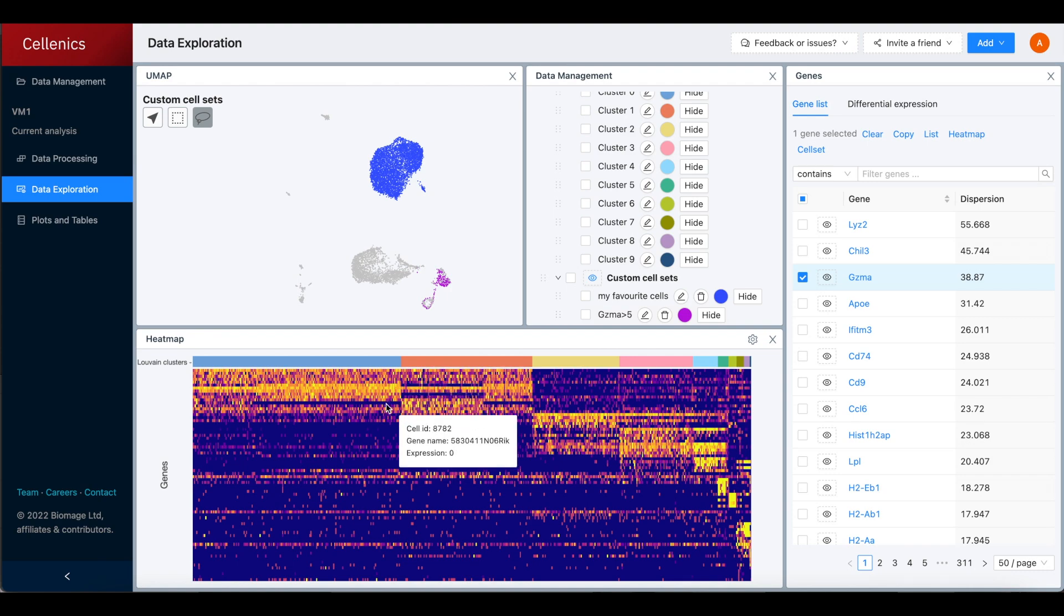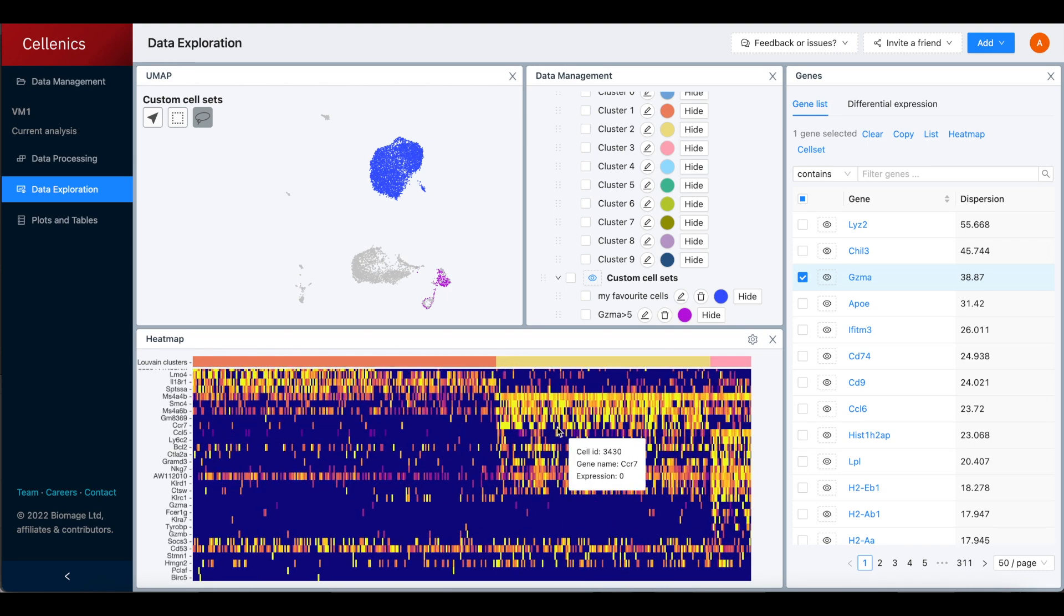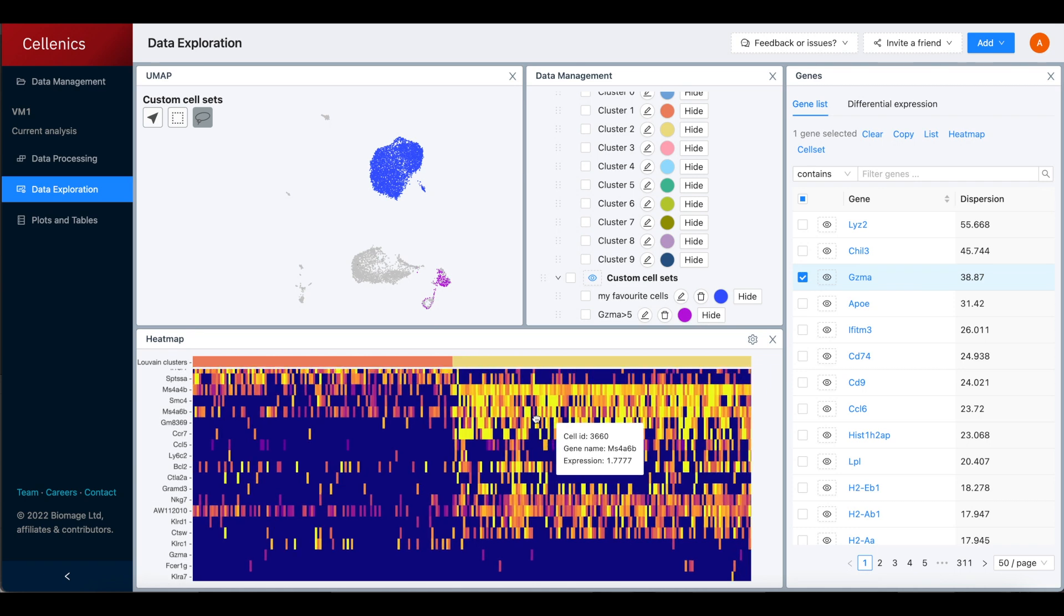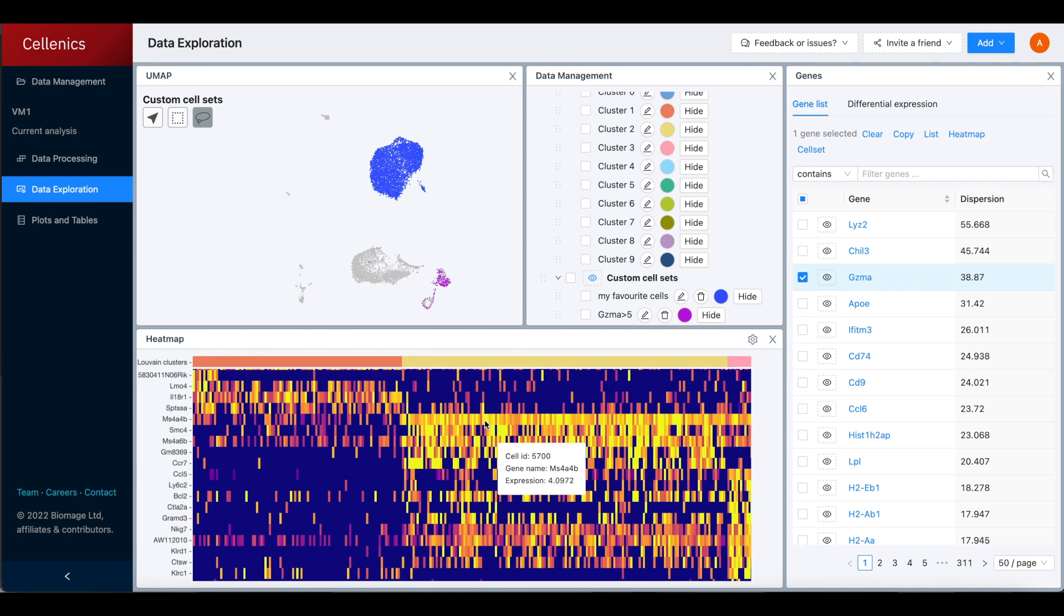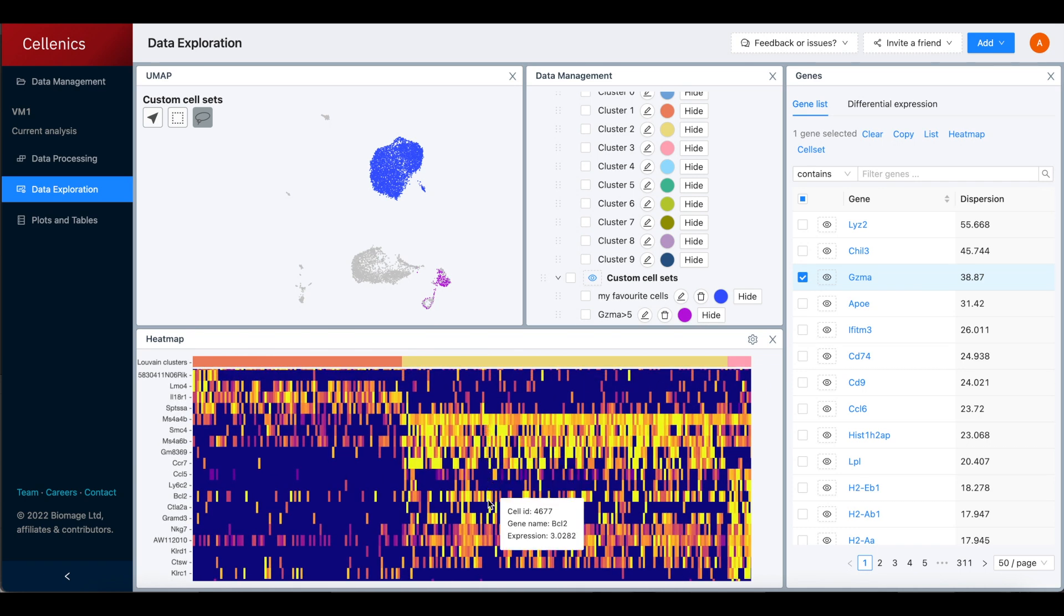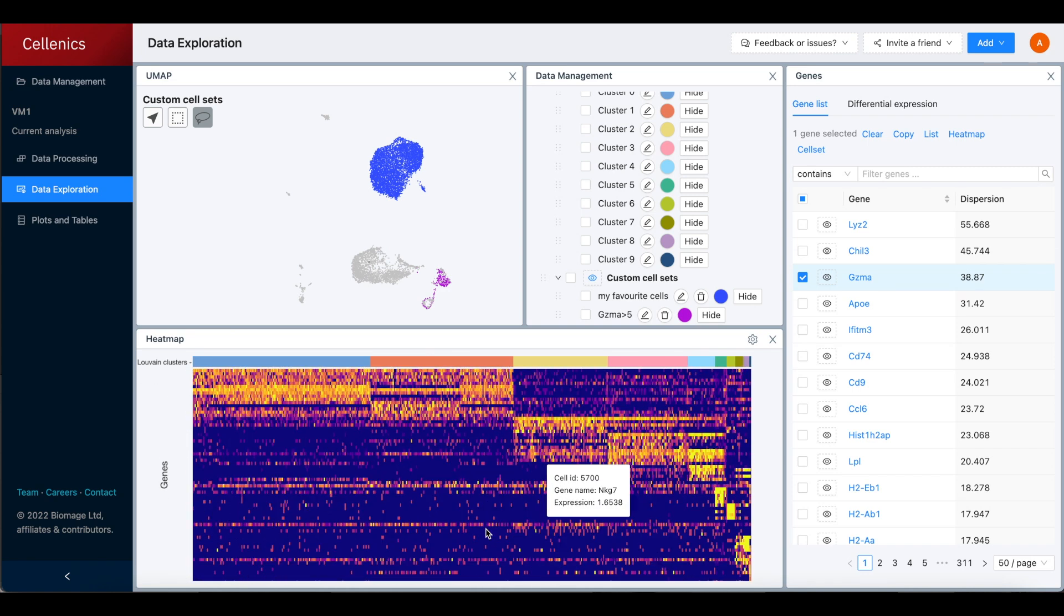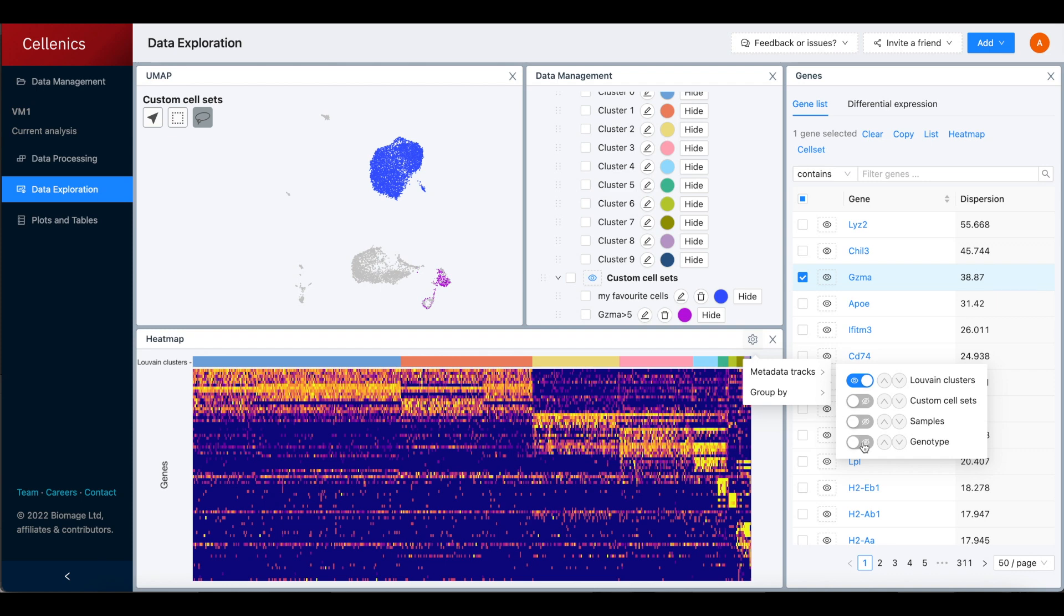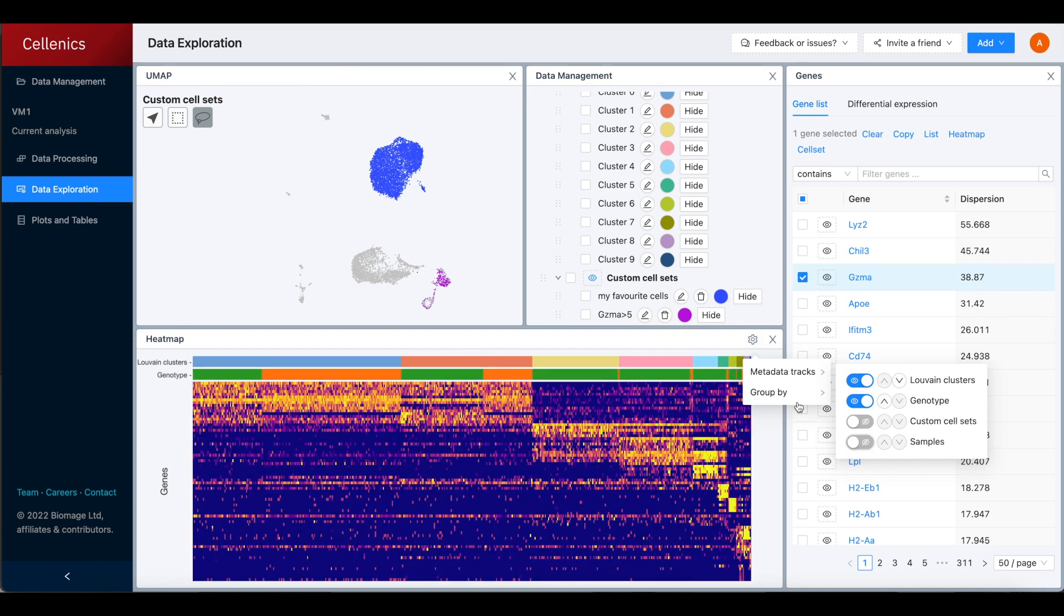The heat map shows marker genes for the Luvin clusters by default. You can zoom in on a specific cell set of interest and hover over the marker genes to identify the represented cell type. Using the settings menu on the heat map, metadata tracks can be added and the heat map can be reordered.